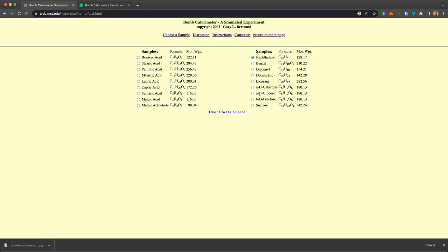So picking a sugar over here, common ones like sucrose or glucose, and then a fatty acid as shown over on the left. So we could pick something like naphthalene.